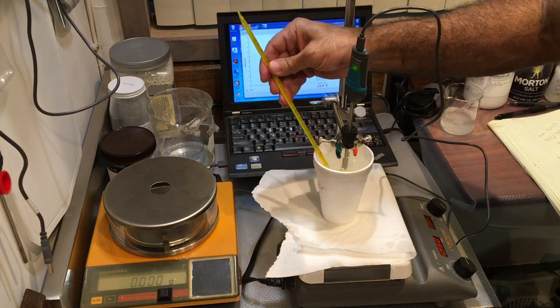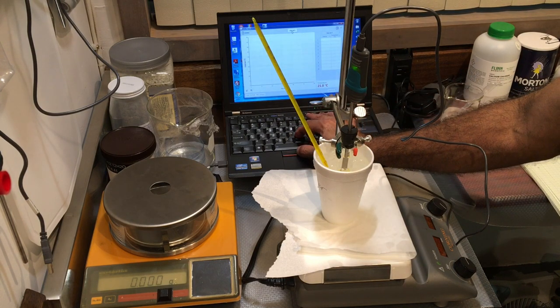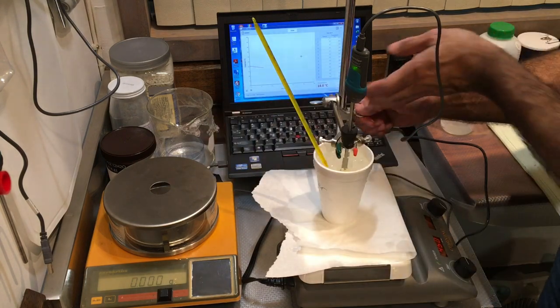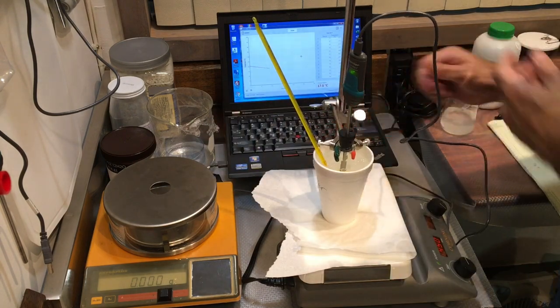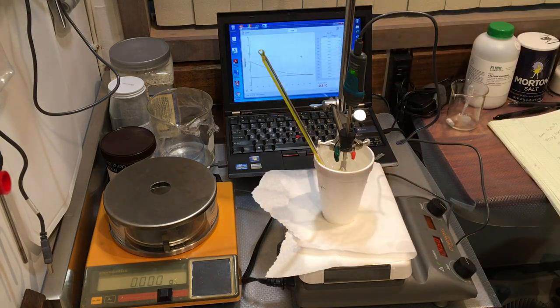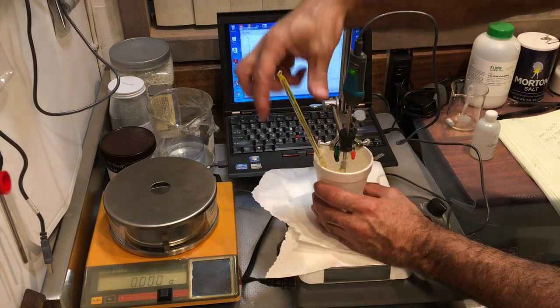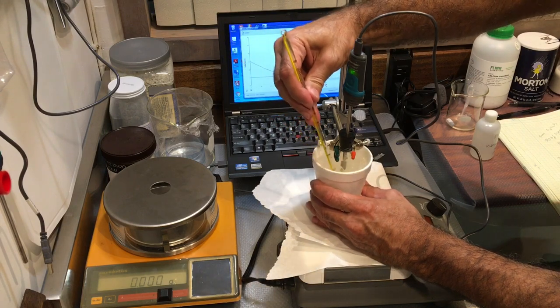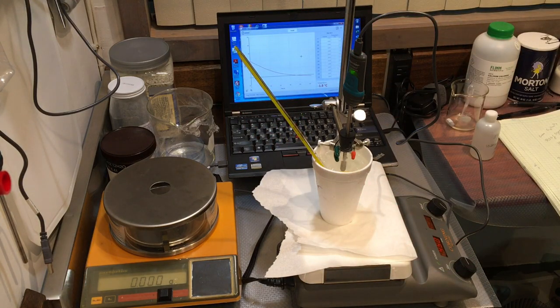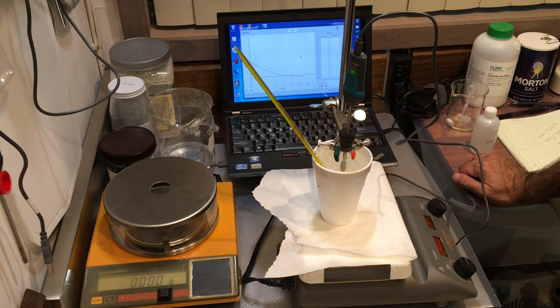The solution is mixing well. Negative 8 degrees — that's pretty good. Let's collect our data. The solution is going through cooling but it is not freezing yet; I don't see any ice particles forming, even though my bath temperature is negative 8. The water temperature is now negative 2 degrees Celsius and still there's no ice.